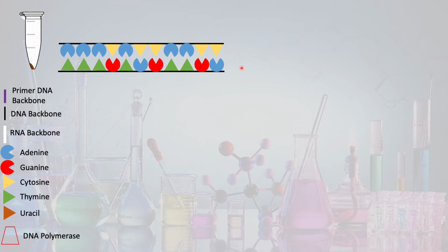So the general process for how this works is that through the use of a thermocycler, which is a machine that will literally cycle through different temperatures over and over and however they are programmed, we'll heat up our samples, allow some chemical reactions that I'm going to describe in a second to occur, and then cool back down.